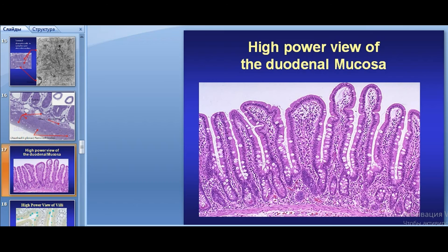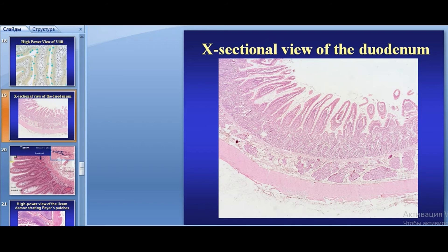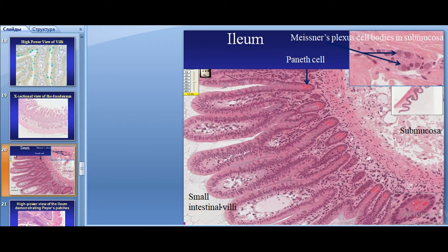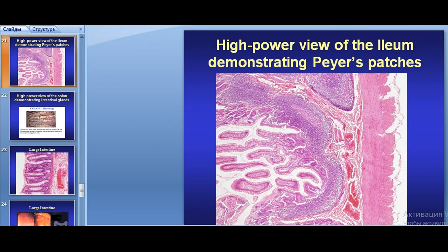Here you can see the duodenal mucosa with many enterocytes composing the epithelium of the small intestine, and a small number of goblet cells located between them — they appear as colorless gaps in the row of enterocytes. The submucosa consists of loose connective tissue containing aggregates of lymphoid tissue known as Peyer's patches, and in the duodenum, Brunner's glands — compound tubular mucous glands.